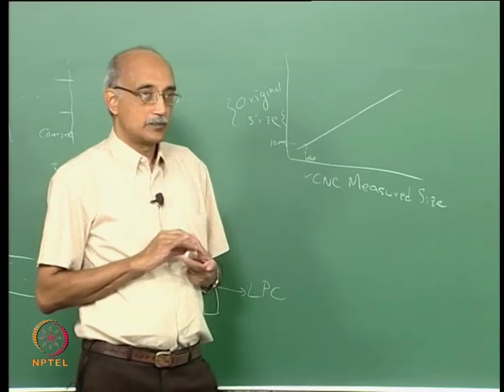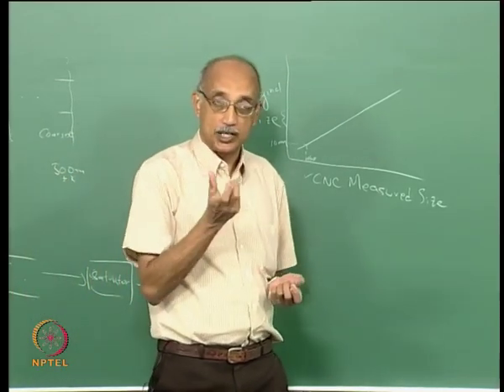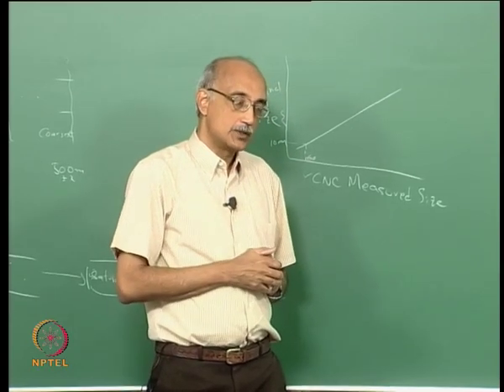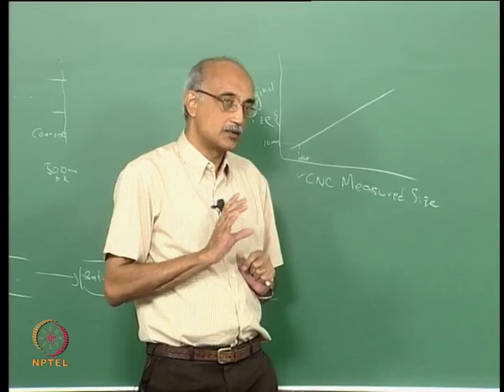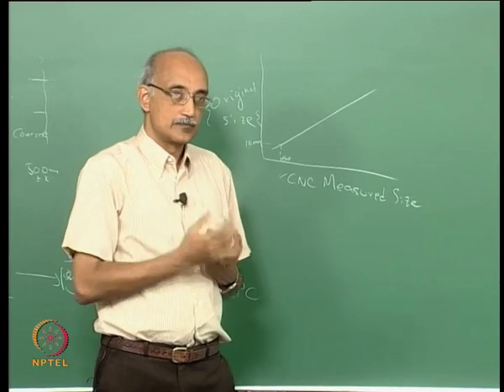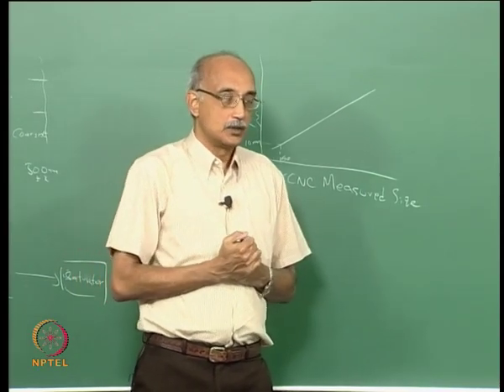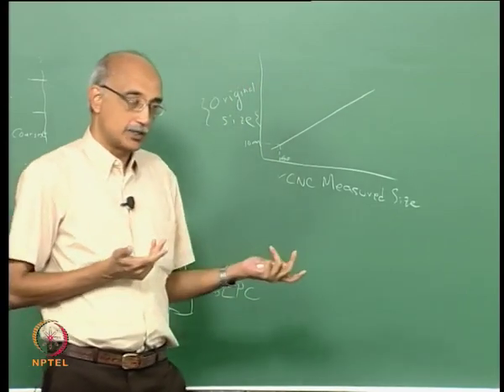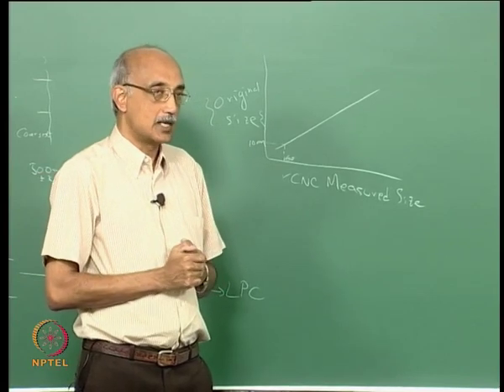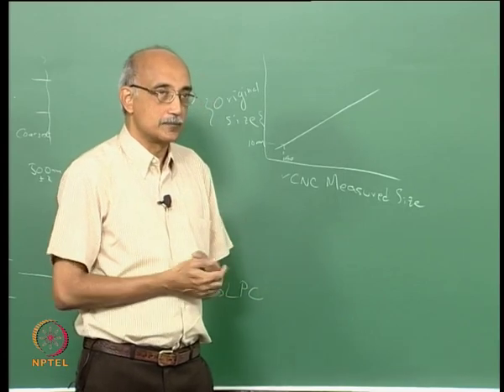Theoretically, sure. The basic assumption is still going to be regarding the shape, because most of our calculations are still based on sphericity. So the error in your theoretical analysis will very much depend on how spherical the particles are. The closer to a sphericity in shape, the better your theoretical calculations would be. But if you use the experimental method of calibration, then your accuracy is very good, but it's not easy to do, and it's not a very good use of either your time or the instrument's time.